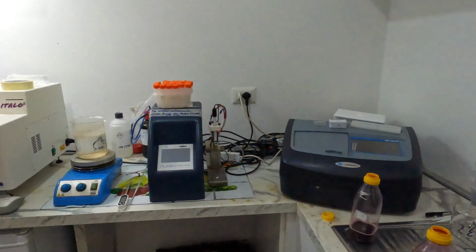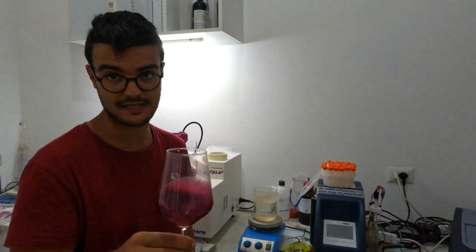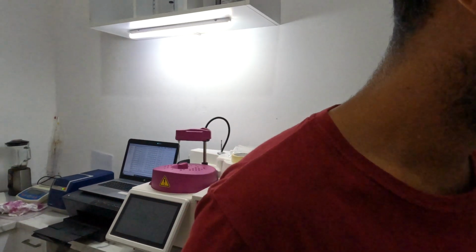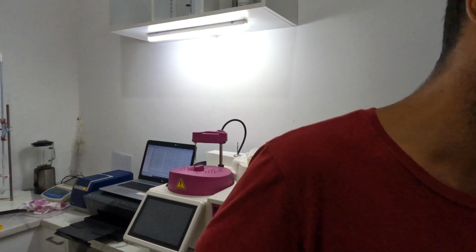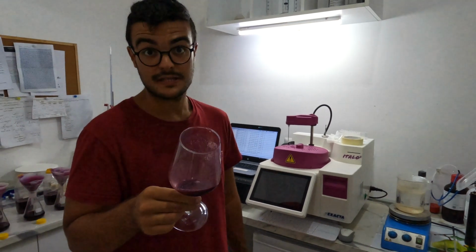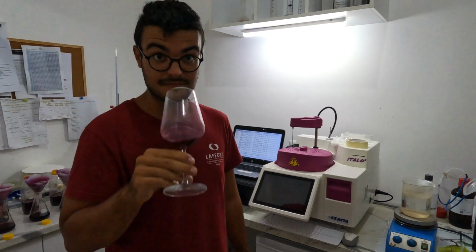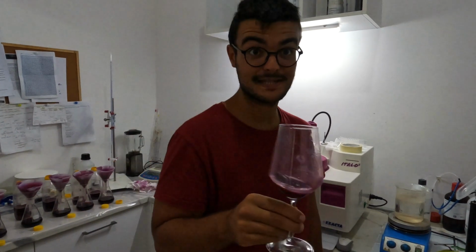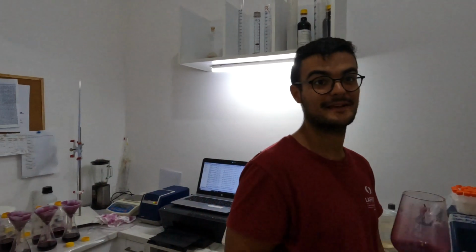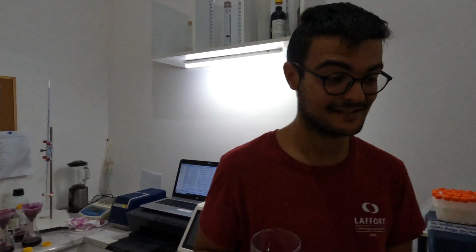This is different because the fermentation started 3 days ago. Okay. So you can smell different types of notes. The vegetal notes are not present, but you can smell alcohol, fruits, red fruits, cherries. You can definitely feel the alcohol now. Yes. This is 3 days? Yes, 3 days.